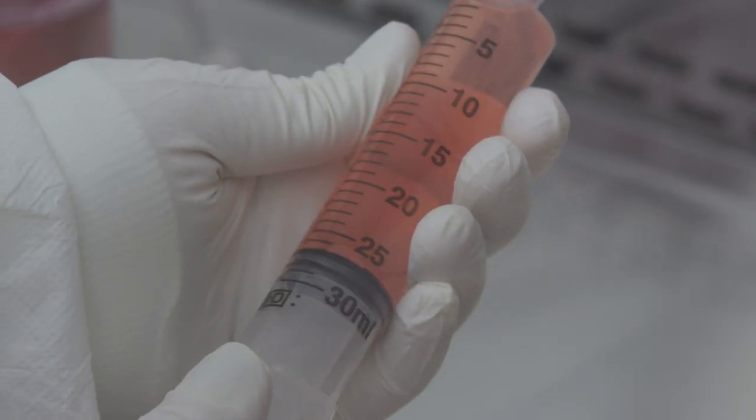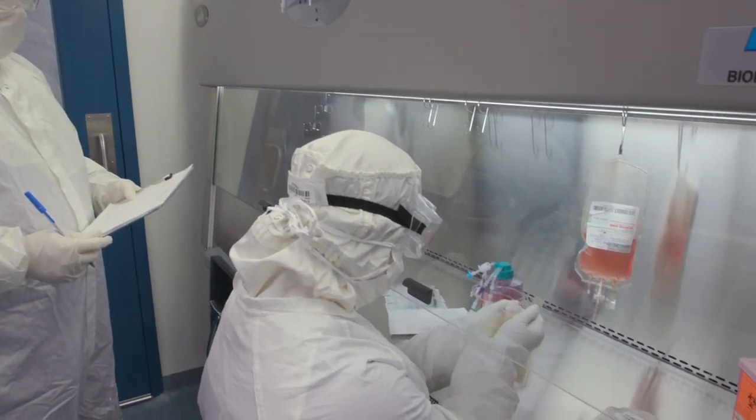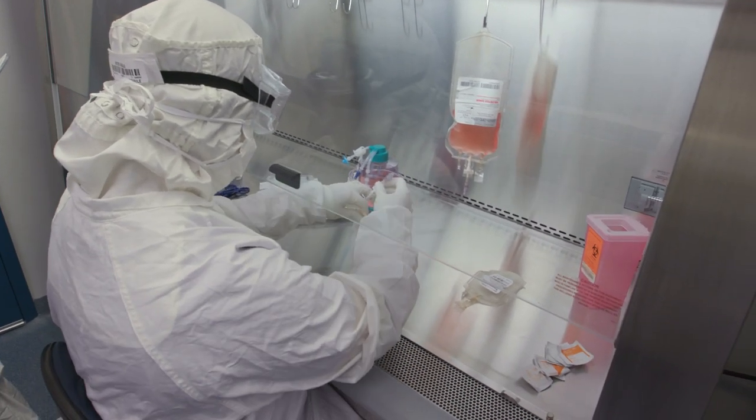Working in a clean room looks like something out of a movie. Scientists gown up in sterile gowning attire to begin their work day. The suits keep their skin and hair particles from contaminating the room.